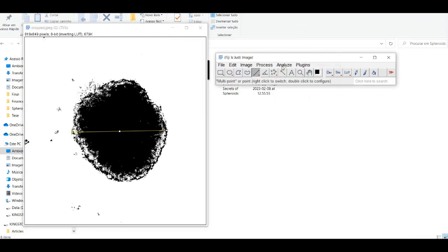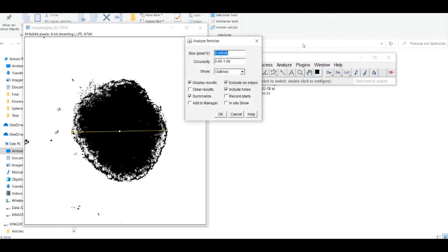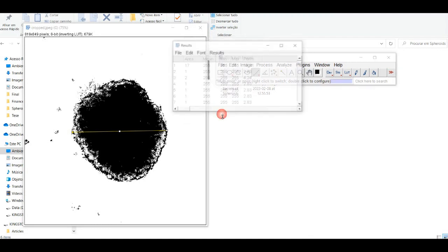To determine the area of the spheroid, go to Analyze, Particles, and check the same boxes as I did. ImageJ will identify several shapes and measure all of them. However, the only one that you need is the one that corresponds to the number in the middle of the spheroid.